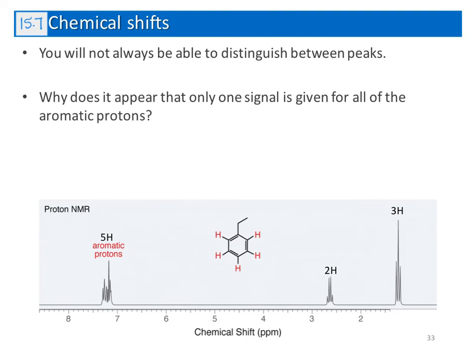A lot of the time with benzene, we'll find that the peaks for these hydrogens appear somewhere between 7 to 8 ppm. These hydrogens are directly connected to the benzene ring, and we expect to see them in this region, so they show up further downfield compared to other protons. A lot of the time we can't distinguish between these hydrogens.